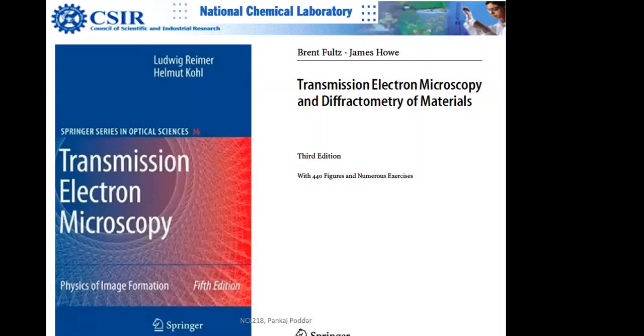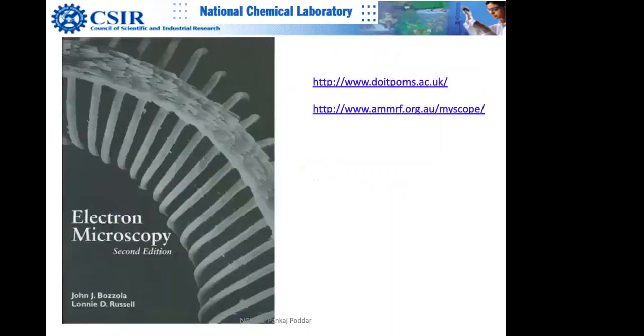I'll skip it. So Williams and Carter famously wrote the equations of the two-beam approximation, when they looked at the elastically scattered electrons, the diffracted beam and the direct beam. Probably I will discuss that complexity in the next lecture. I will discuss with Gaurav later on how complex you want it and how deep you would like to go in the next lecture. So this is for the biologists.